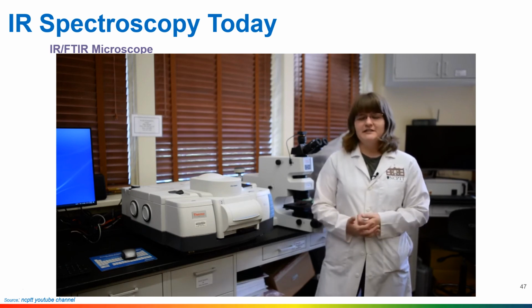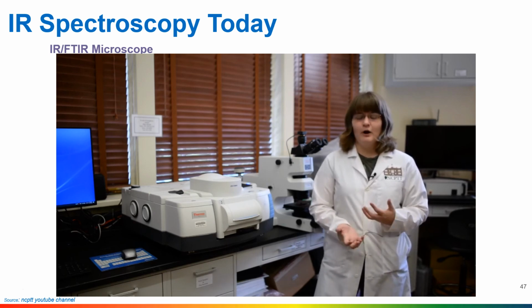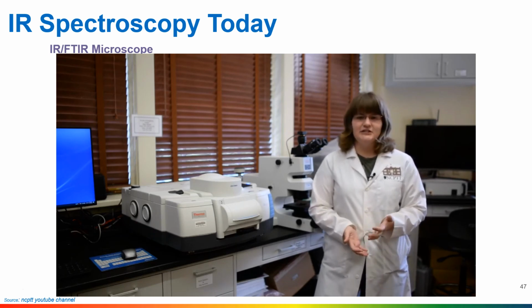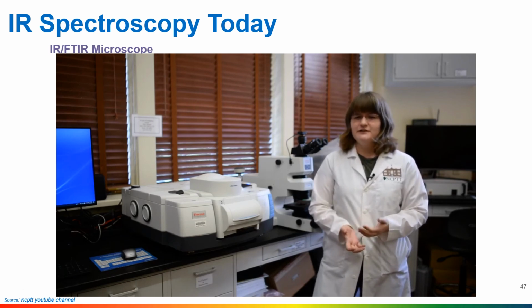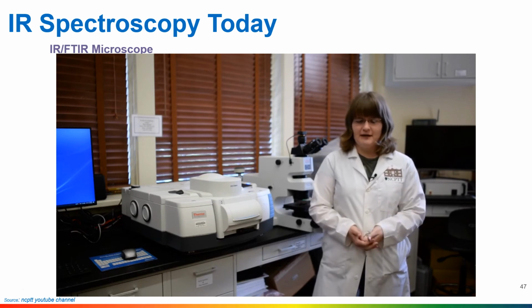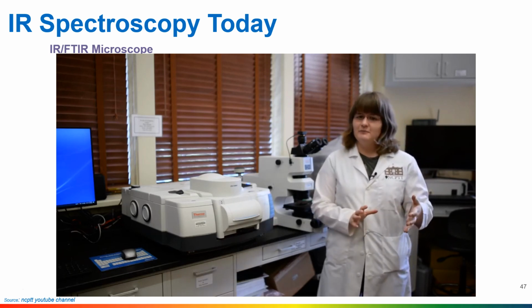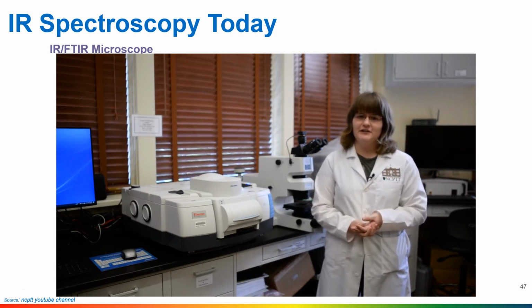So like for my project specifically, I'm studying how herbicides affect the properties of historic stone and masonry materials. So one of the tests that I'm using with this is, in addition to looking at whether there's herbicide residues left on the surface, I'm interested in seeing whether any of them have penetrated into the material itself. So I'm performing a test with this to see if the artificial accelerated weathering process pushed the herbicide into it and how deeply that penetration occurred.